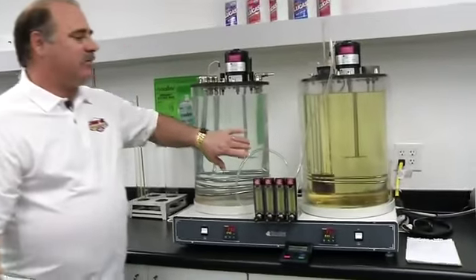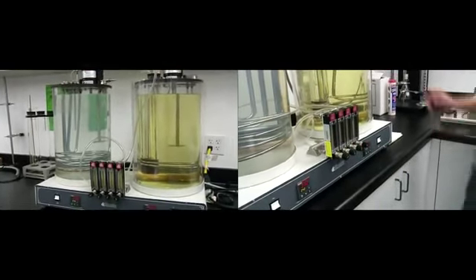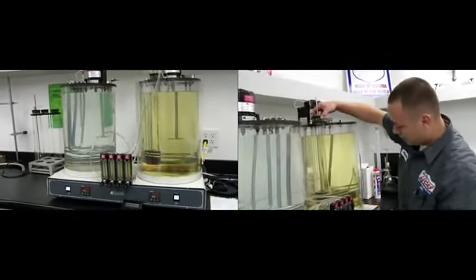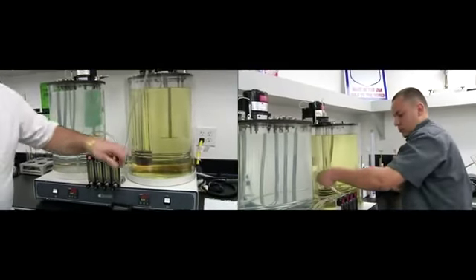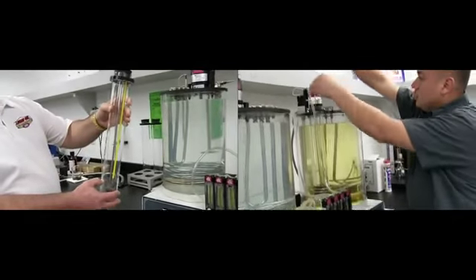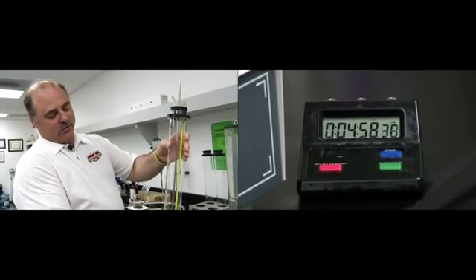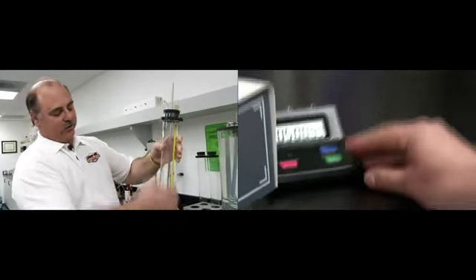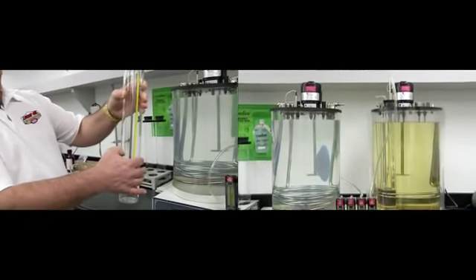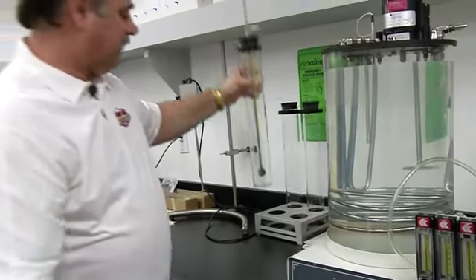This instrument here is our foam tester, and this measures the amount of foam that is generated in engine oils, automatic transmission fluids, industrial products. What we do is we fill this graduated cylinder, which is this right here, up to 200 mLs, and then we introduce an air source. We measure for a 5-minute period how much foam is generated, and then we remove the air source and determine whether the foam actually dissipates over a 10-minute period. This is an extremely important test because you do not want to have air in your system. It creates cavitation and eventually wear.